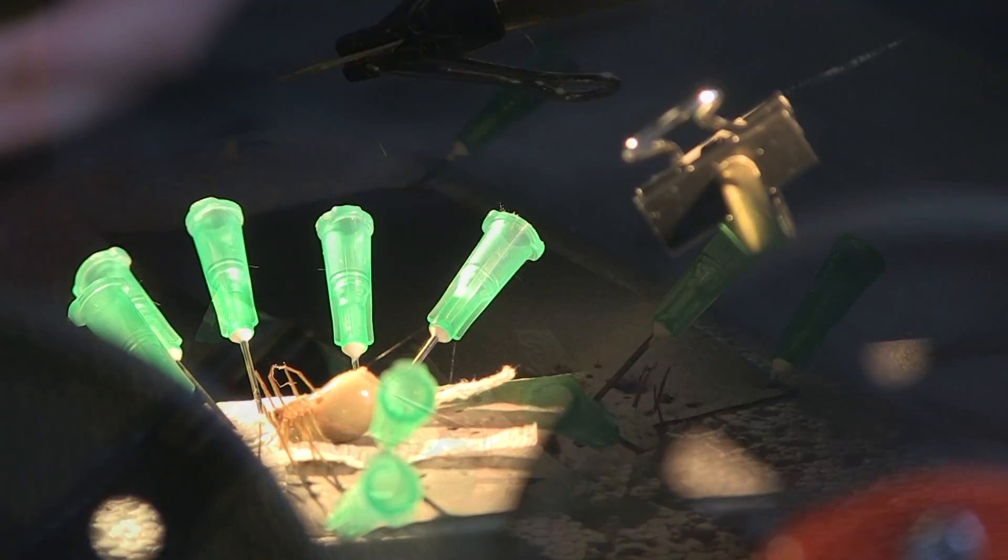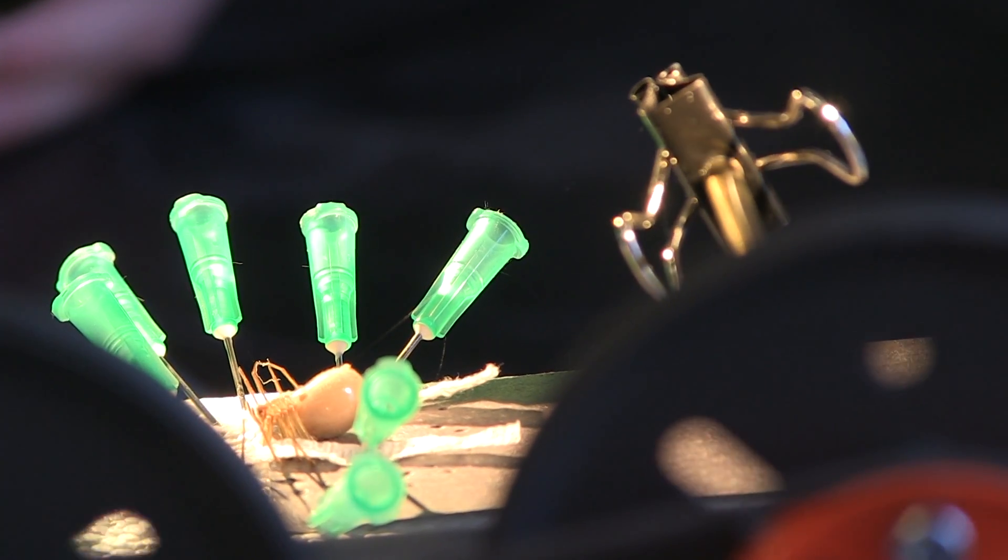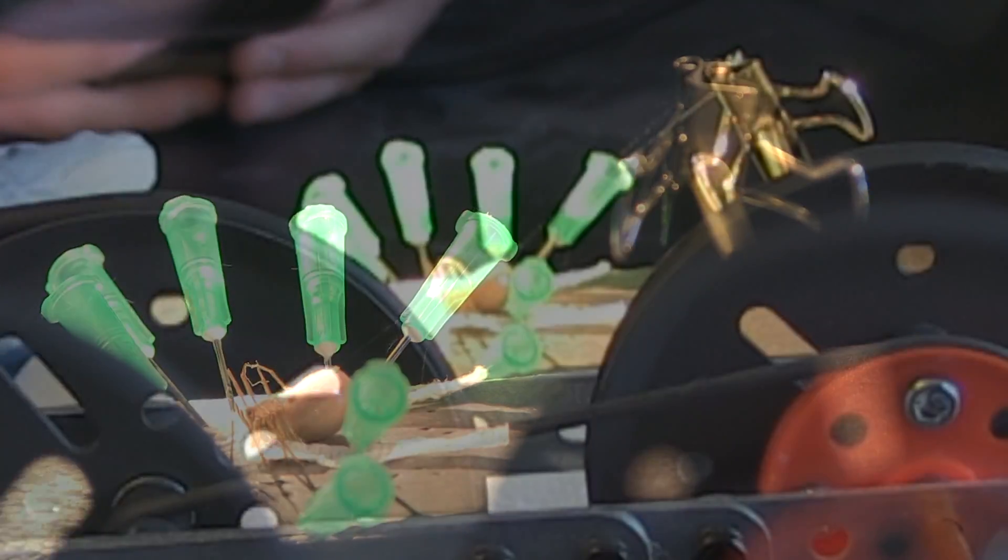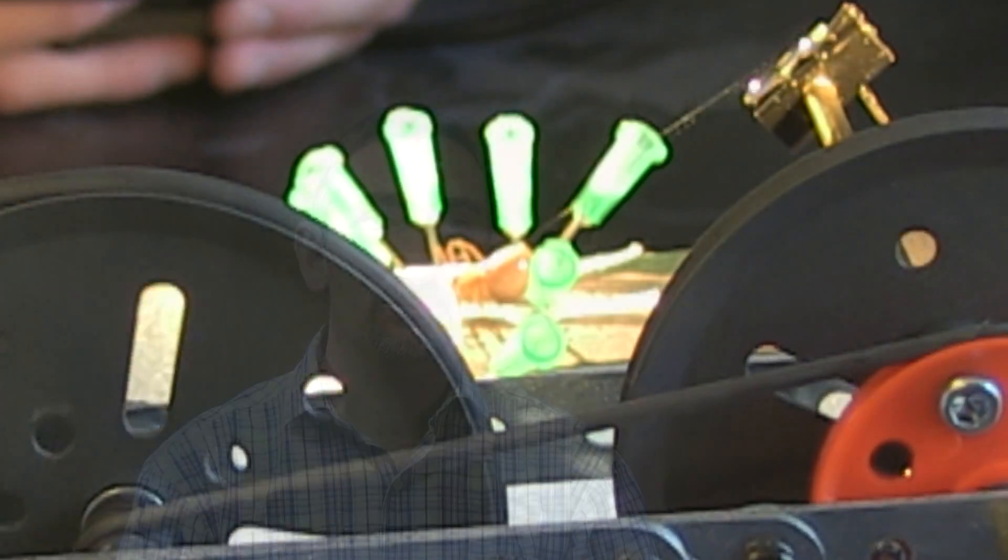That is about one one-thousandth the width of a human hair. In the very long term, we really think the goal would be to make synthetic materials like this. Can we synthesize materials that are as strong and stiff and tough as the fibers from the spiders?